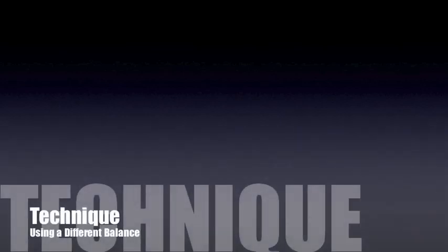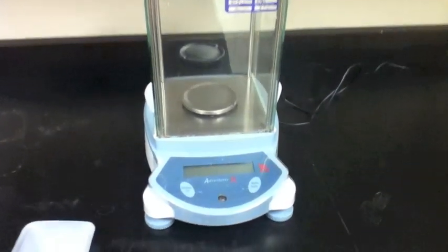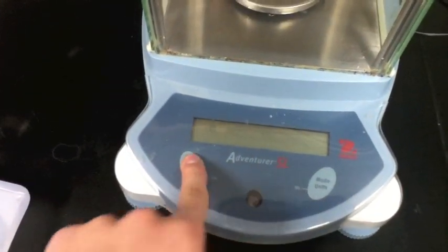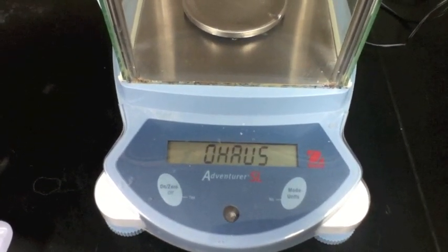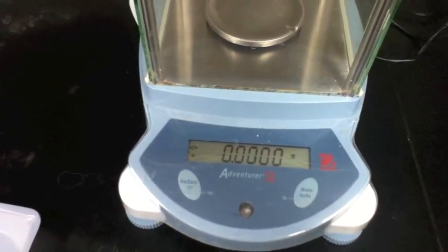I'll now demonstrate this technique using a different balance. Notice that on this particular model, the mode button is on the right-hand side, while on, zero, and off are on the left. I press the on button to turn the machine on and allow it to display zero.